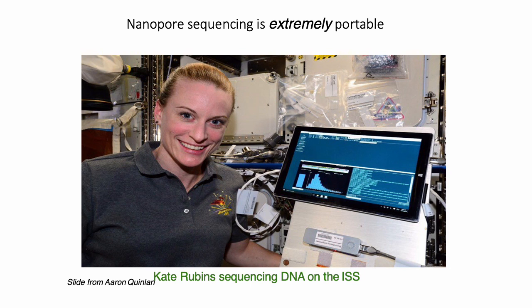And so the last point I'll make is that nanopore sequencing, at least compared to Illumina, for example, is extremely portable. And so here's an example of nanopore sequencing being used on the International Space Station.